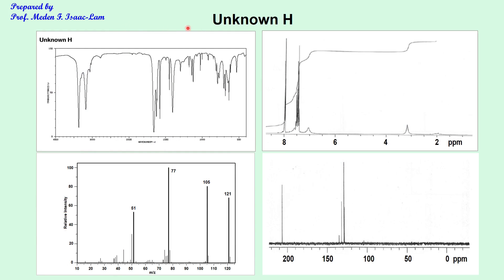This is an example of an unknown that will be assigned for each student. There are going to be four different spectral data provided. The first one is the IR spectrum. You should be able to distinguish it because it is percent transmittance versus wavenumber, going from 4,000 to 400 per centimeter.